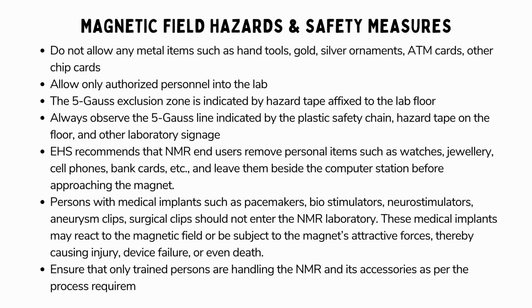Individuals with medical implants such as pacemakers, biostimulators, neurostimulators, aneurysm clips, or surgical clips should not enter the NMR laboratory, as these implants may react to the magnetic field or be subject to the magnet's attractive forces, resulting in injury, device failure, or even death. Ensure that only trained individuals handle the NMR and its accessories according to the required process.